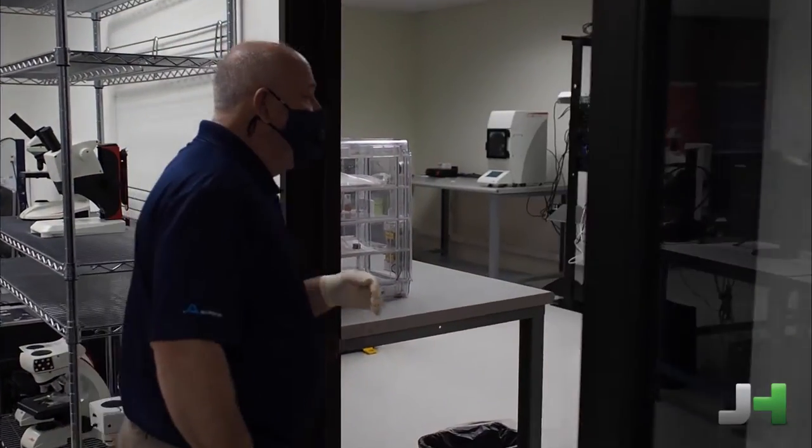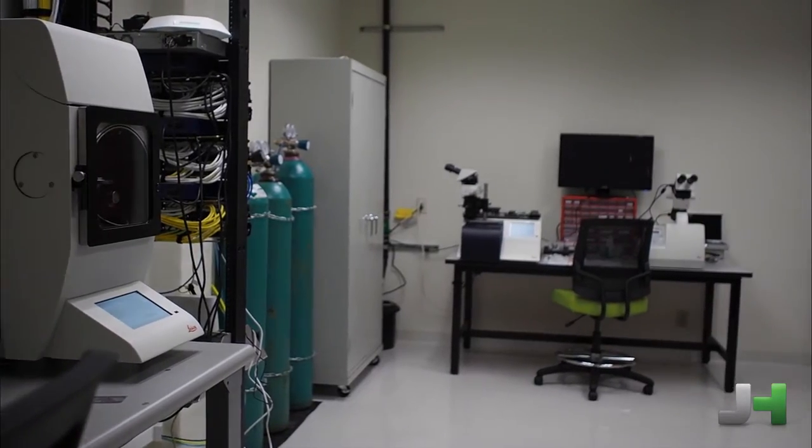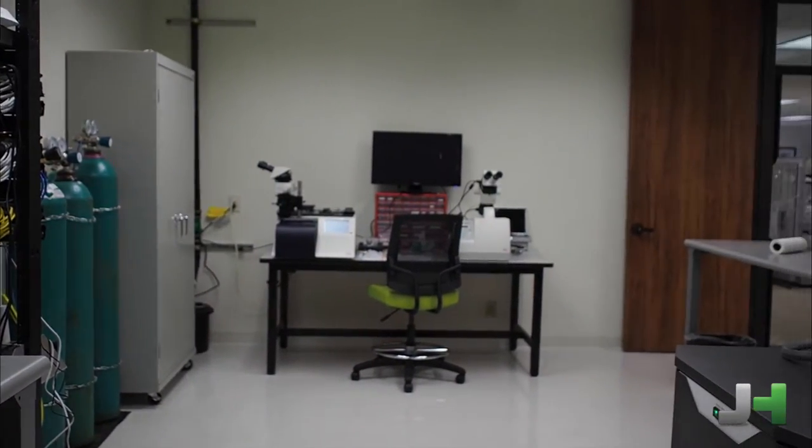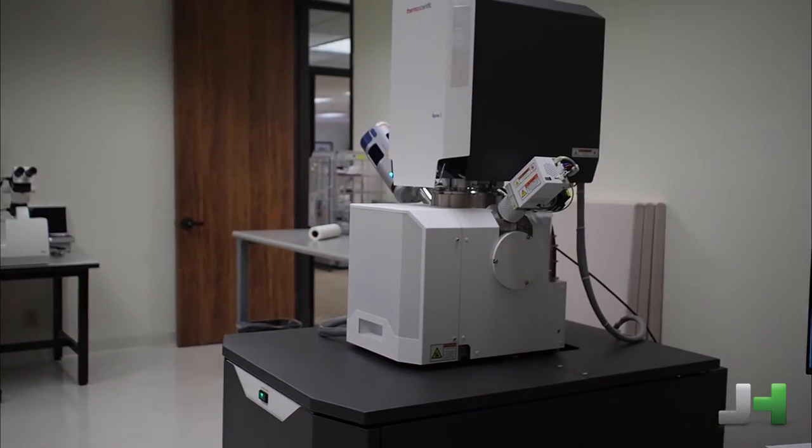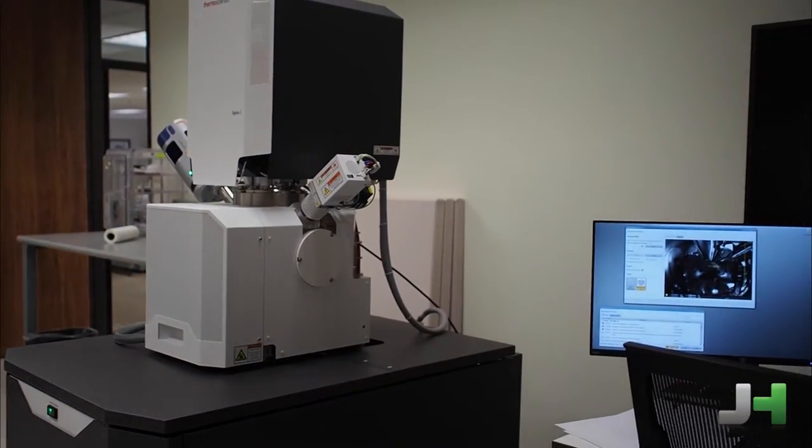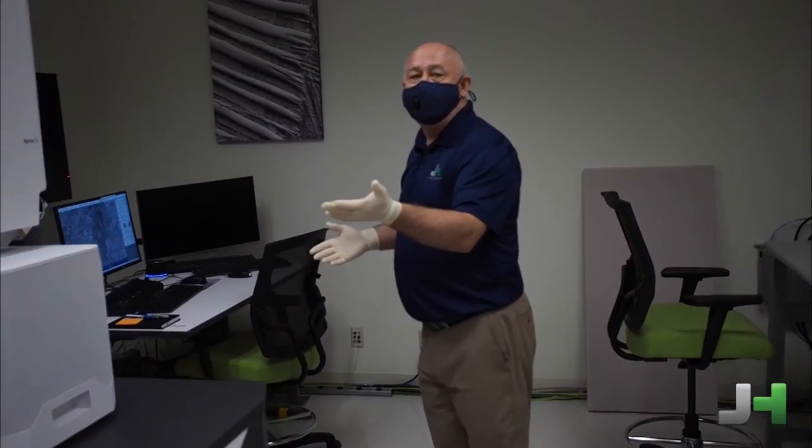And then we're going to move into our high power SEM inspection room. So this room has an SEM built into it. The instrument itself is one of the newest from Thermo Fisher, the Aprio S. Very capable tool.